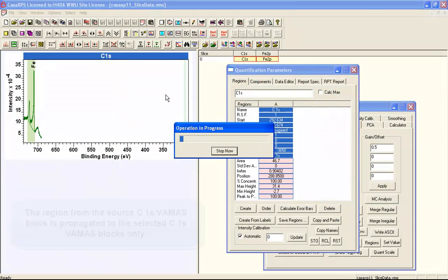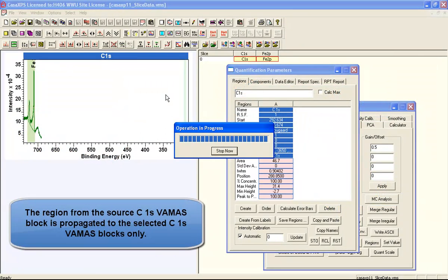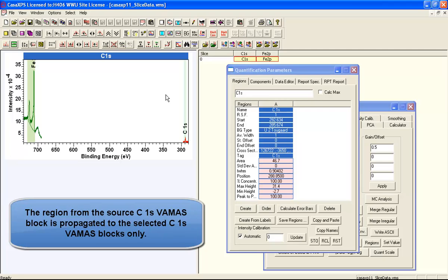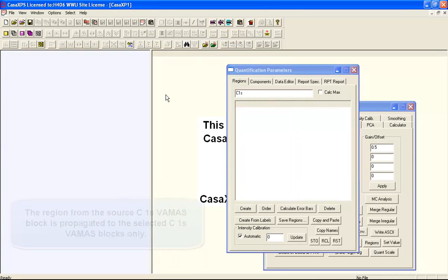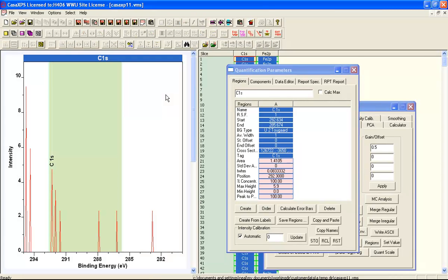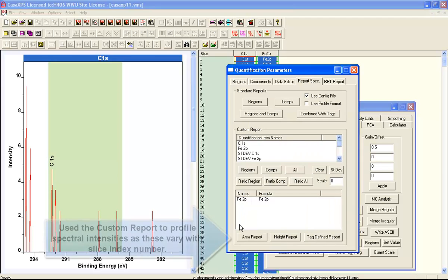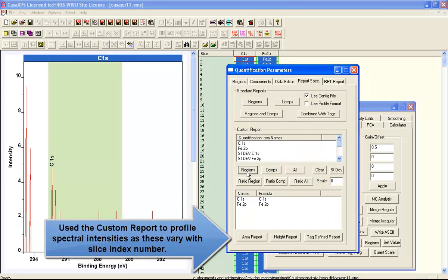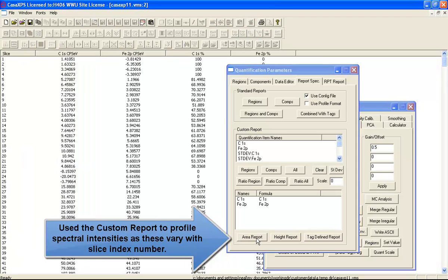What we'll do is organize a selection to illustrate another feature in CASA: how to profile a data file and use the profile information to make a selection within the data file.